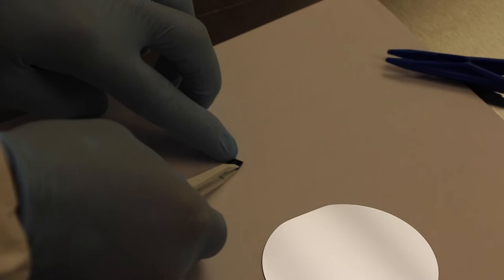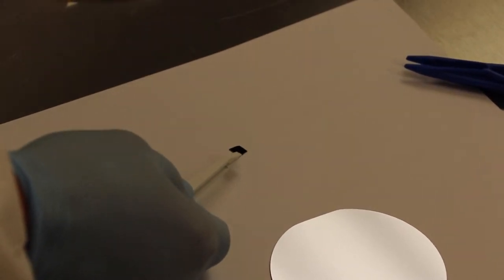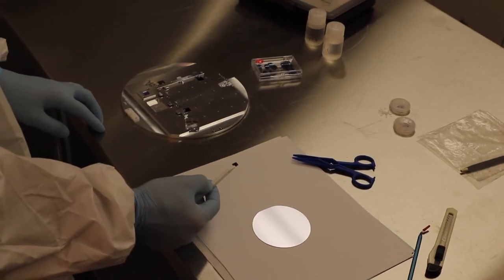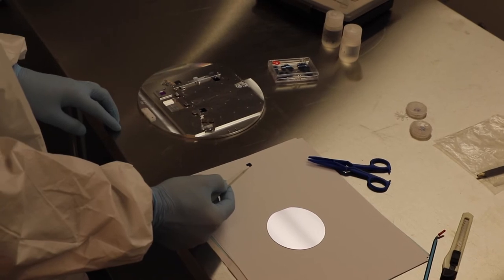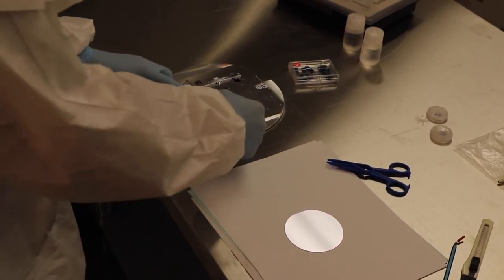The most commonly used test material is a silicon wafer, basically a glass-like surface covered with chemicals such as PMMA, which is also called a resist.